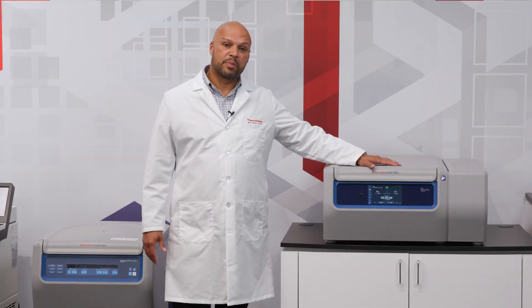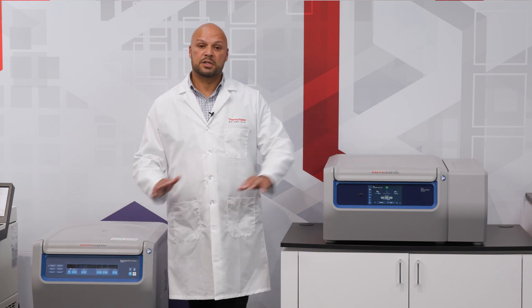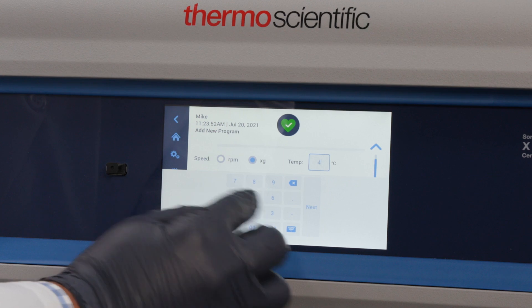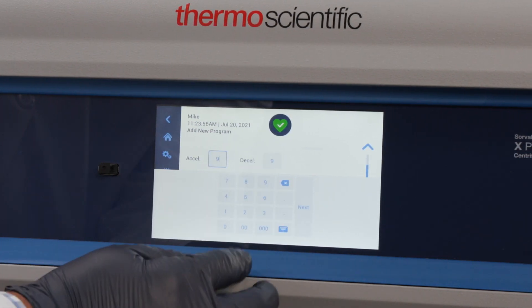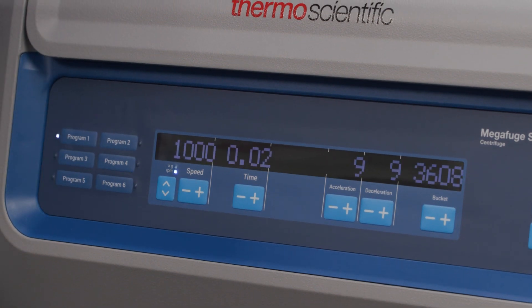As you see here, we have an X4 benchtop and an ST4 floor model. Either unit is available in either format. The programming on the X4 will allow you to save up to 100 programs with steps included if necessary, where the ST4 will only allow you to save 6 programs.